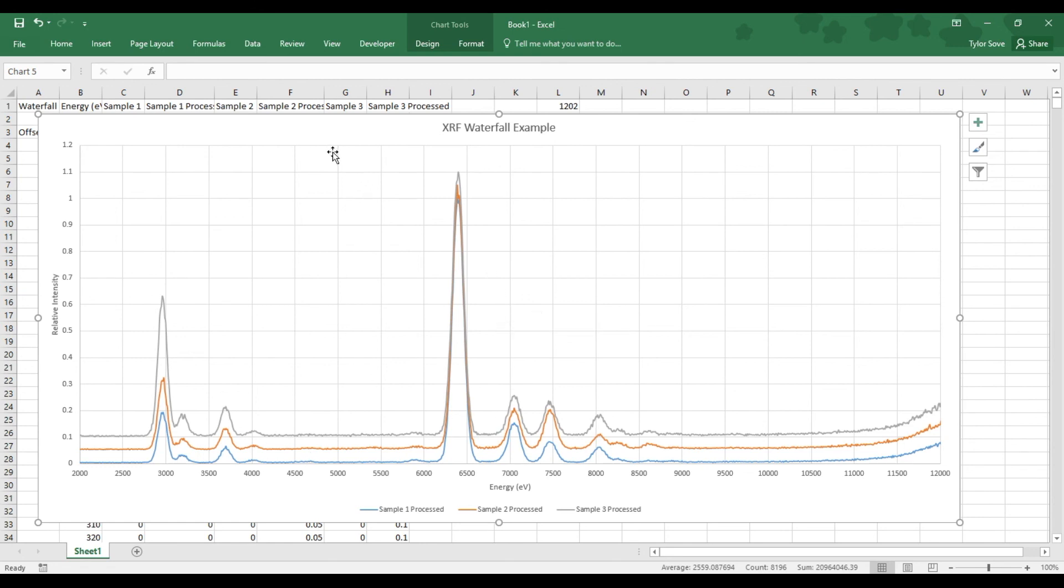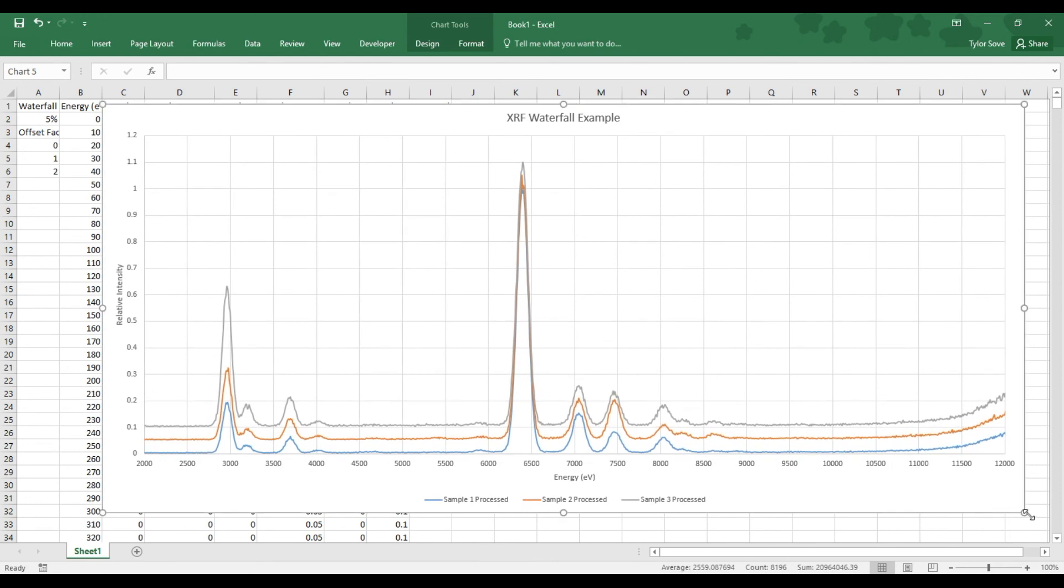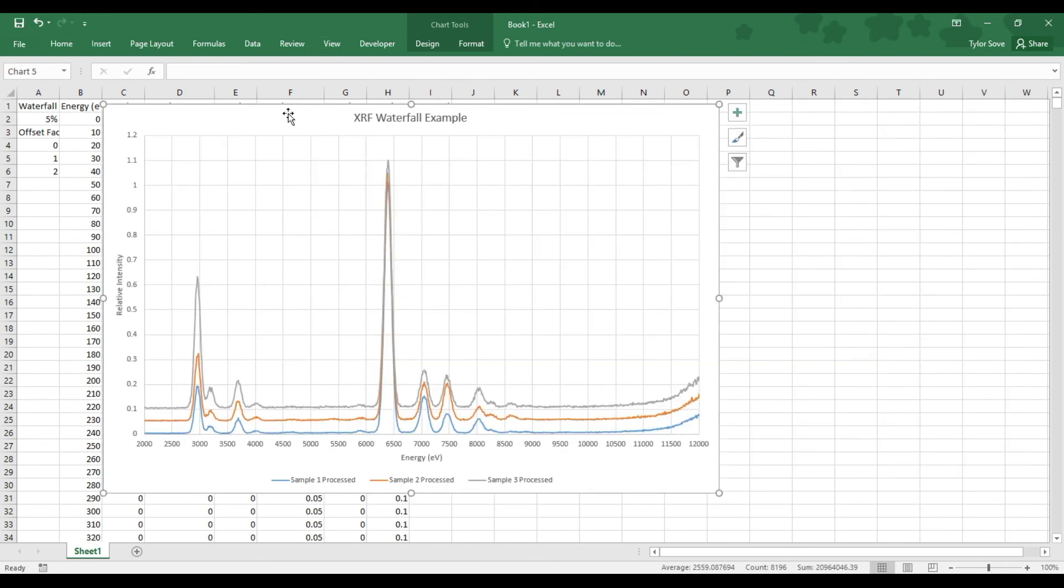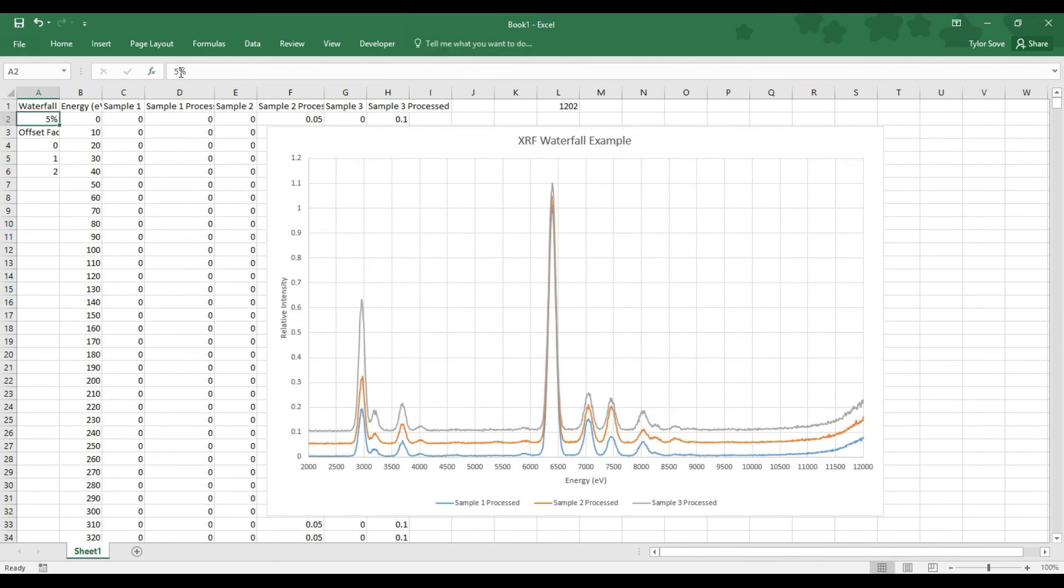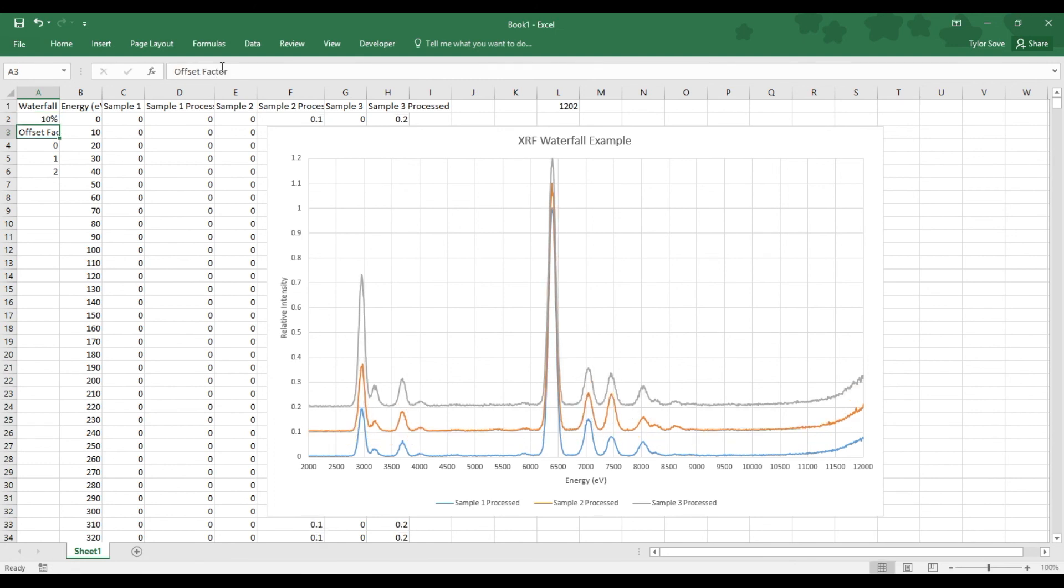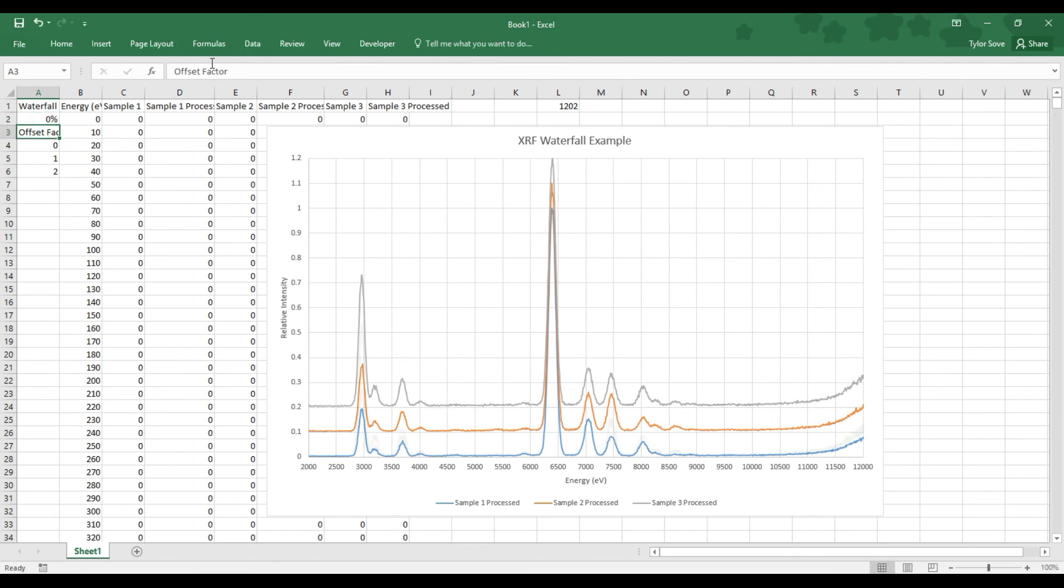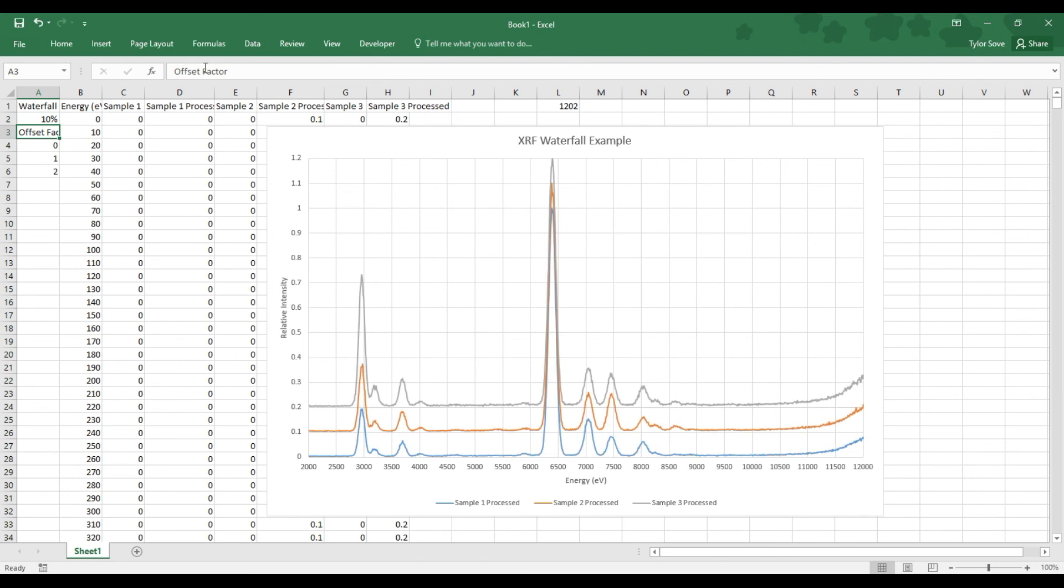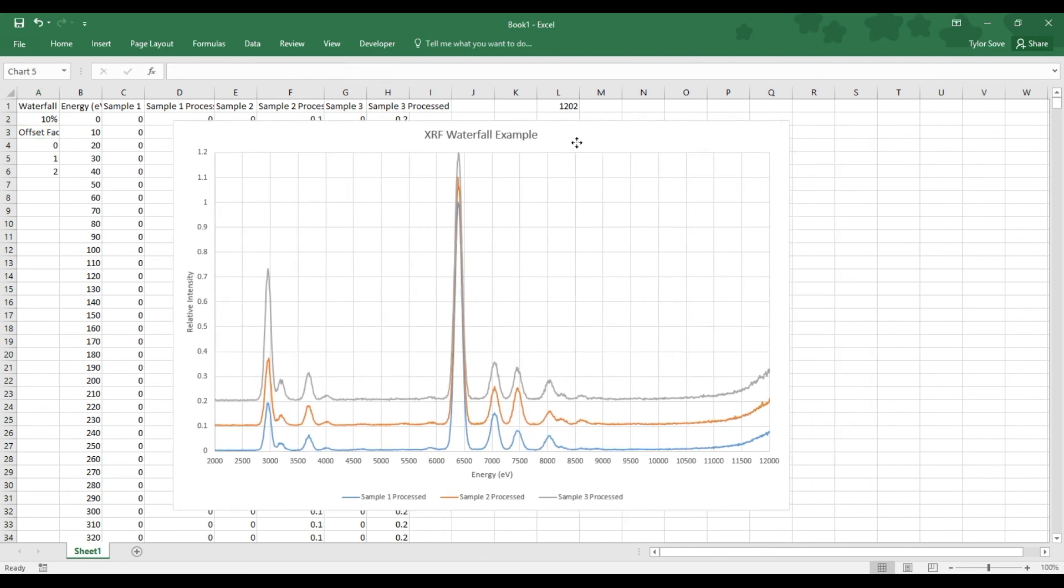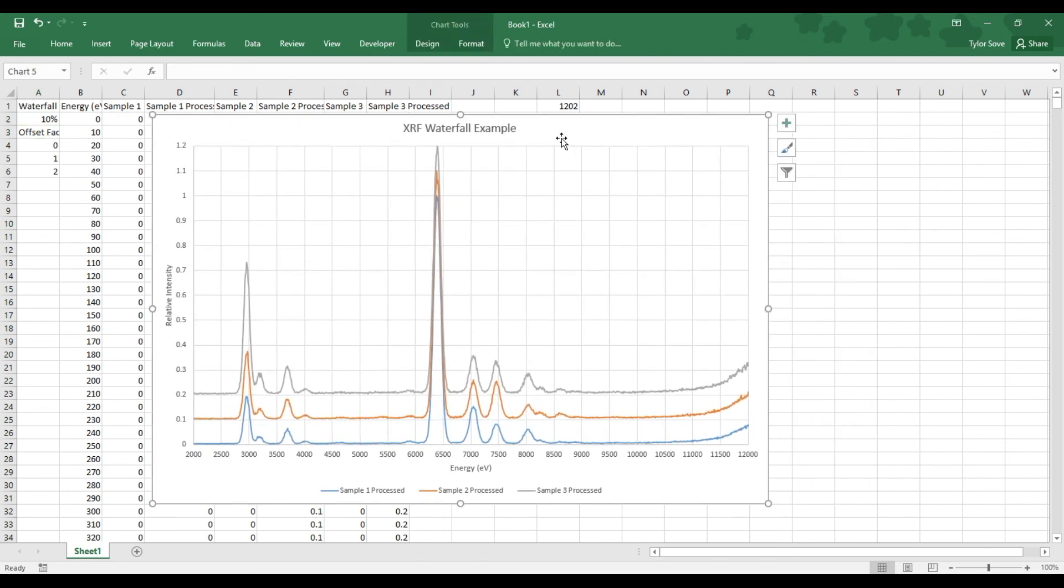Alrighty. Now that we have this graph shown, I can change a few of these parameters off to the left to show you what changing them does. For instance, I'm going to change the waterfall offset amount. This time we'll make it larger to 10%, and we can see that these graphs have scaled themselves out further. Now if I lower this down to 0%, they were overtop of each other as a traditional XRF graph. But as this is a waterfall graph, a little more separated is the way to go. Alrighty, so that is an XRF waterfall graph.